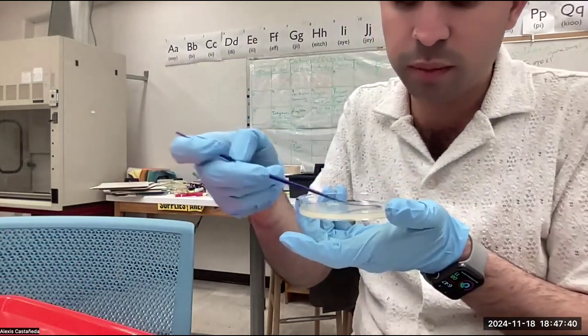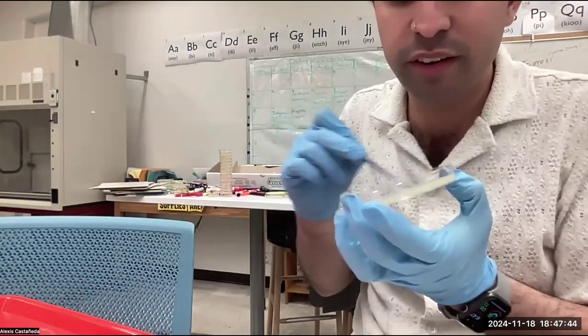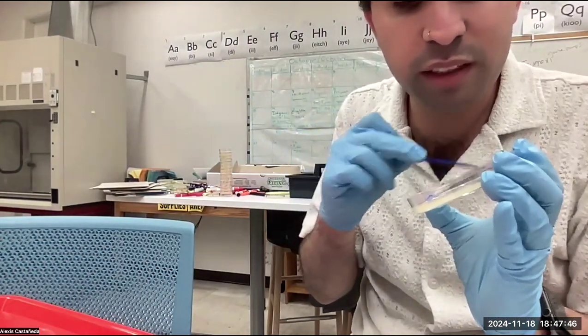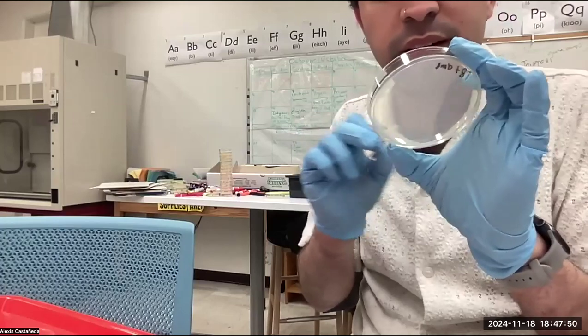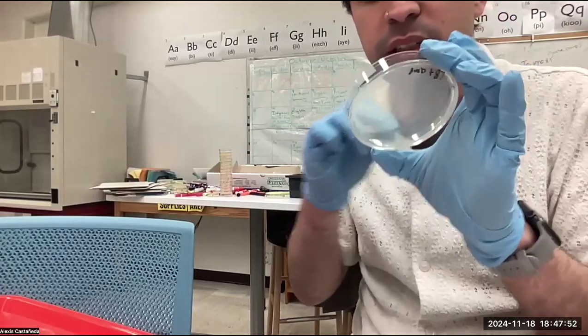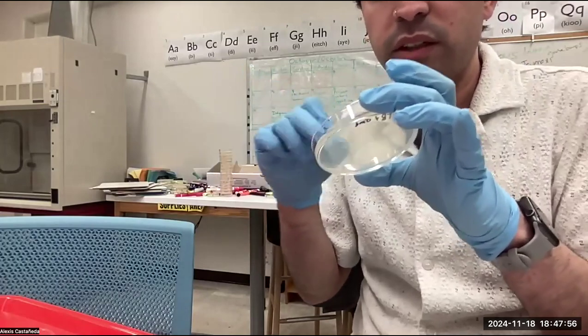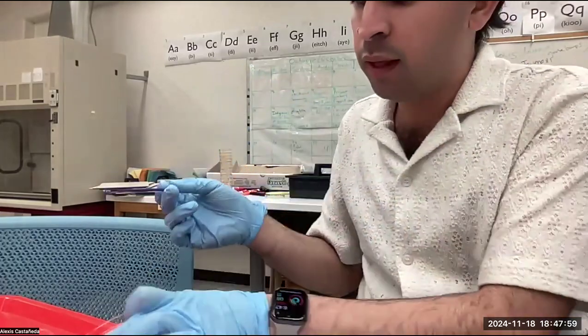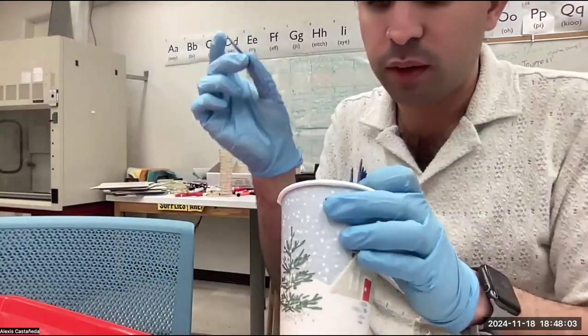So I'm going to streak right on top again, just very gently spreading over the surface. Again, the agar is very fragile, so you should just barely be scraping over the surface. You don't want to rip the agar. The agar can rip very easily, but just make sure that you see that you have put the bacteria all over the surface. So then again, always putting our loop in the waste container.